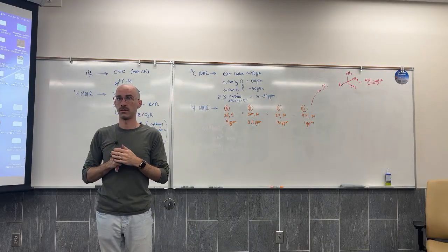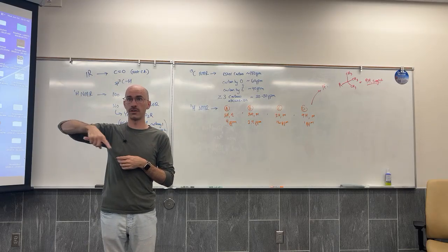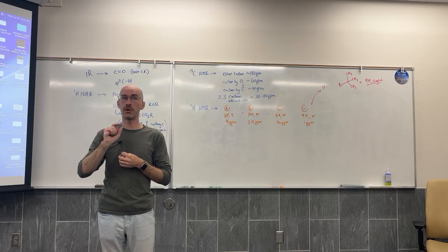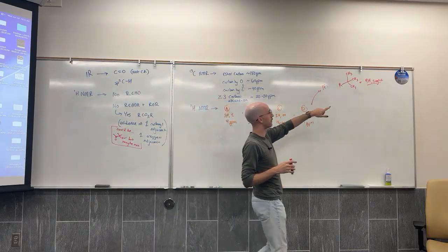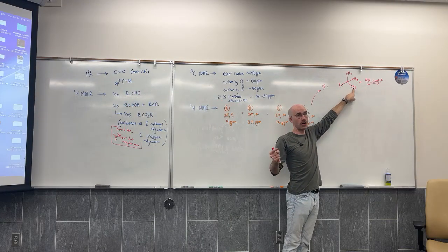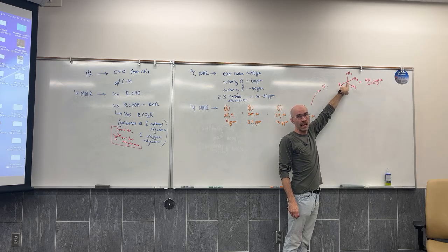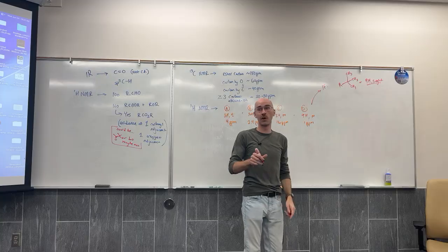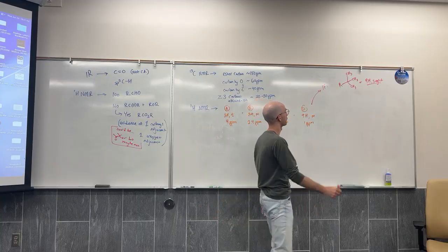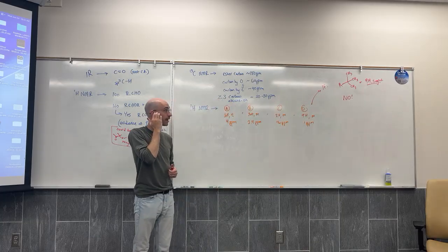We're saying it'd be a singlet because they're not unique hydrogens? We're saying it'd be a 9H singlet because they're all identical and they have 0 neighboring hydrogens. And that's based on the carbon? Yeah, remember, these hydrogens, their neighbors are on the adjacent carbon. Hydrogen, carbon, carbon. How many hydrogens on their neighboring carbon? 0, because the rest of the molecule has to be attached. So these would all show up as a singlet. So tert-butyl, out. So we have to figure out something else.